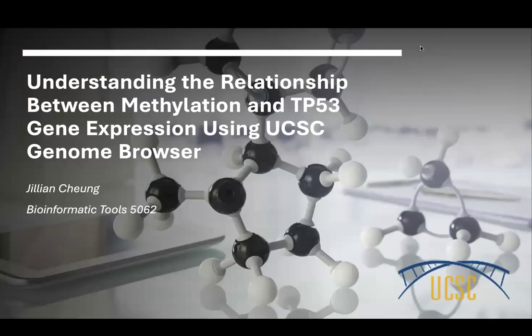Hi everyone, I'm Jillian, and in this tutorial I'm going to walk us through how I used the UCSC genome browser to explore whether DNA methylation at the TP53 promoter corresponds to differences in TP53 expression across two different human cell types. So the UCSC Genome Browser is a powerful visualization tool that integrates large-scale genomic datasets, and what makes it stand out is its ability to overlay multiple types of data all in one view.